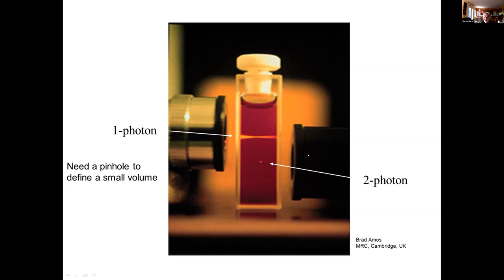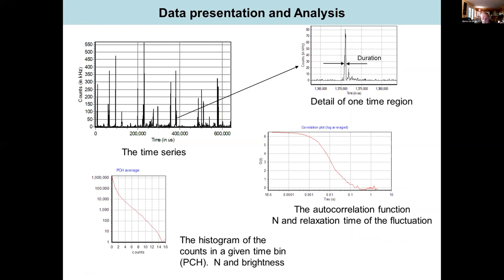But on this side, you have a photon source which produces very short pulses ordered in time. And then you can see just one spot. This is important because that is the spot that we will observe for illumination. The size of this spot is due to the camera resolution used by Brad to obtain this information. But one thing you can see is that nothing is excited around that spot. This is very important because here everything is excited along this line, and here nothing is excited along this line. So let us see what happens if we do the experiment today.